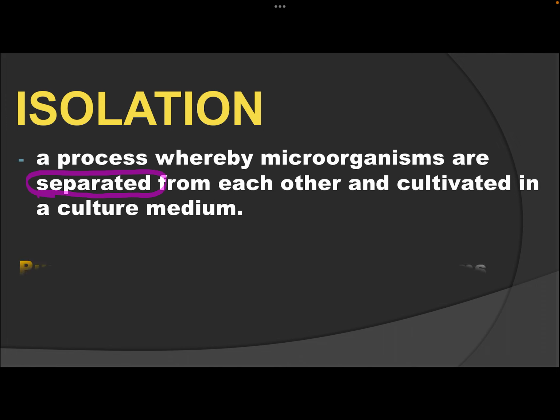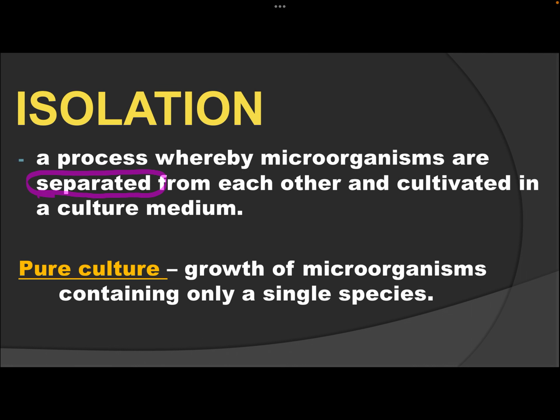And of course, our aim is to produce a pure culture, meaning to say we only have a single species of microorganism. If you read a book, some of the terms that you can encounter in isolation techniques, or when you are studying pure culture, is the term stock culture.